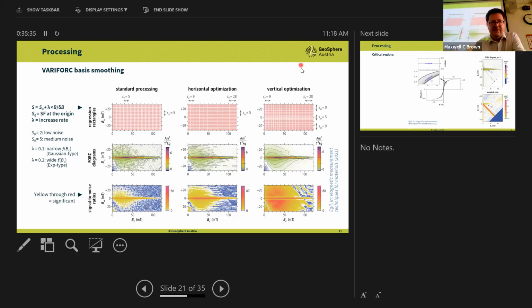So what you can do is to increase the smoothing factor as you are moving to the right and as you are moving away from the horizontal axis, right? So you stretch basically your smoothing factor in both directions. And the result is that you keep the large resolution that is needed here, for instance, around Bu equal to 0, but you increase enormously the significance region of your function. So that's the basic, let's say, that this can be applied always.